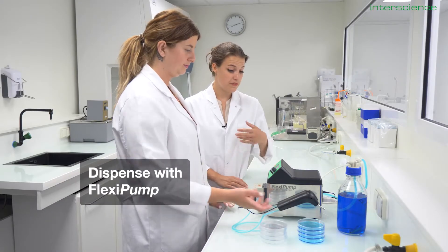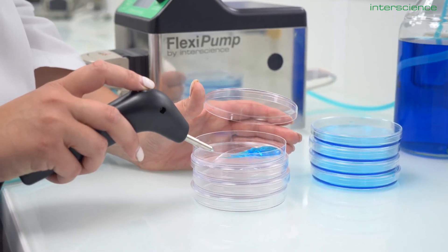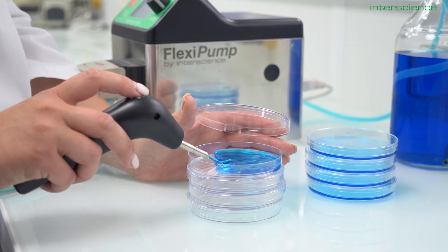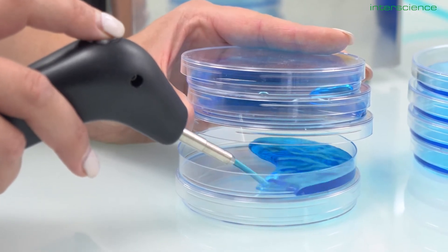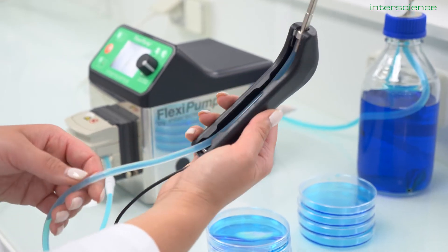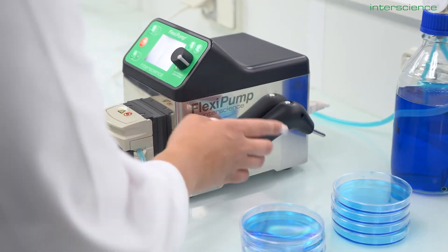Now for the most versatile equipment in our whole arsenal: the FlexiPump is a high precision tool for sterile liquid dispensing. You can prepare your own petri dishes or dilute buffer, or have your test tubes ready for a serial dilution. With the autoclavable tubing that fits nicely into the handy gun, you have a user-friendly dispensing method that also protects you from hot liquids.